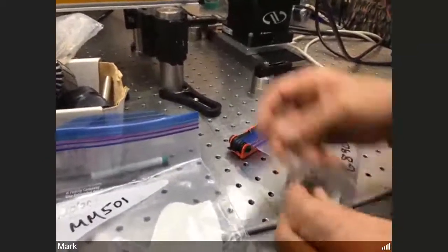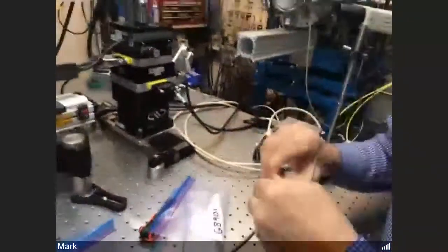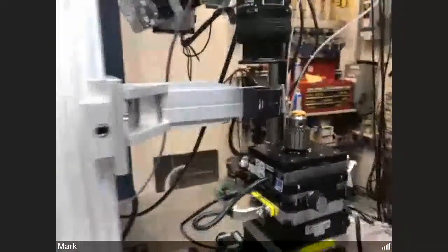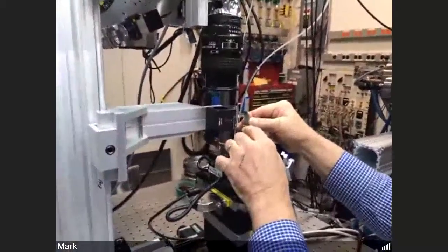So what we're going to use to hold these today is just some plasticine, like modeling clay, and put a piece of that on the drill chuck, and then press the sample into the plasticine firmly enough that it's not going to wiggle and it's not going to fall off.